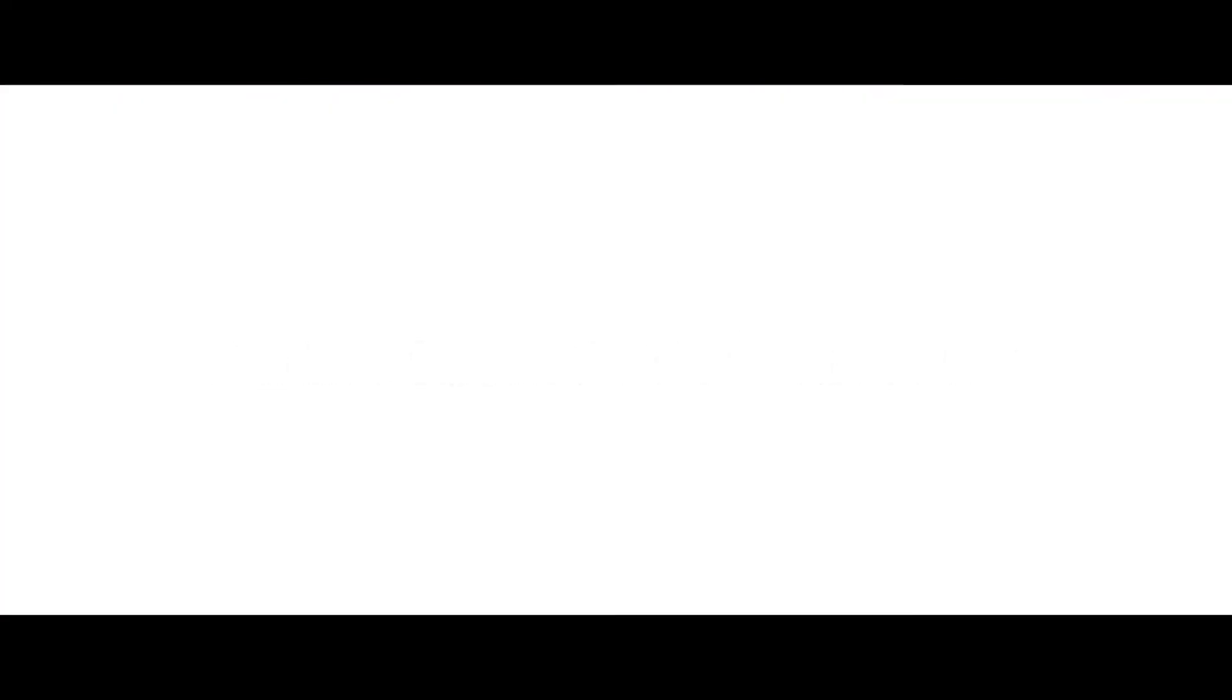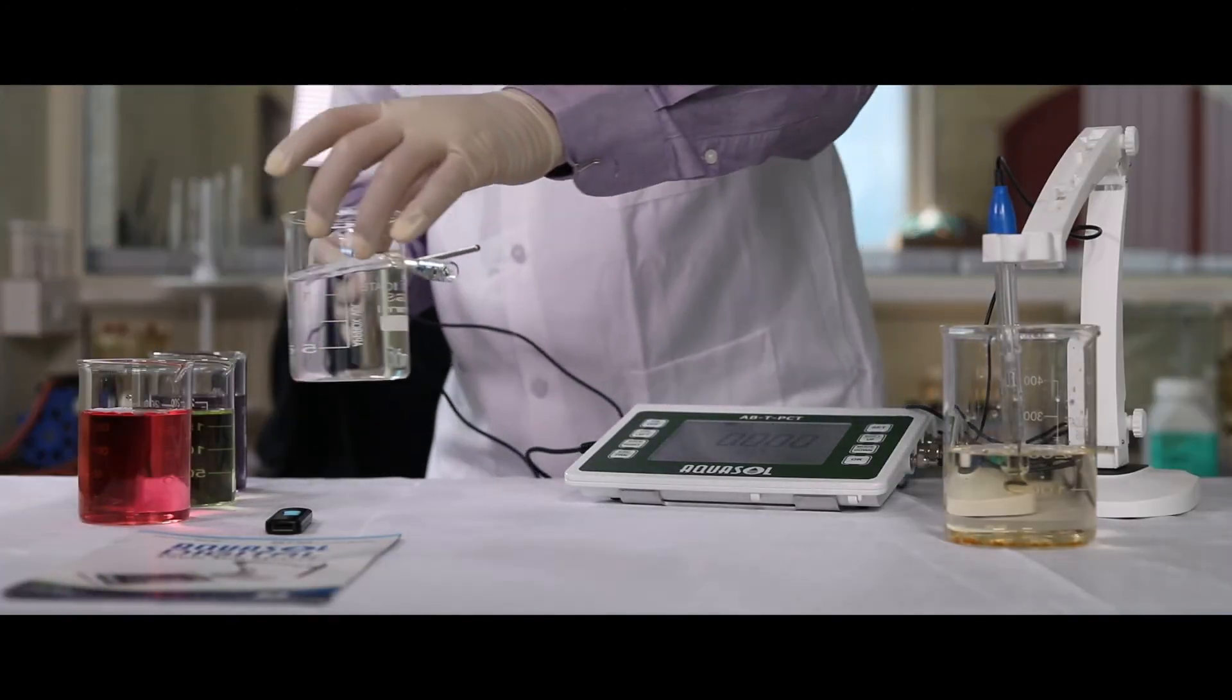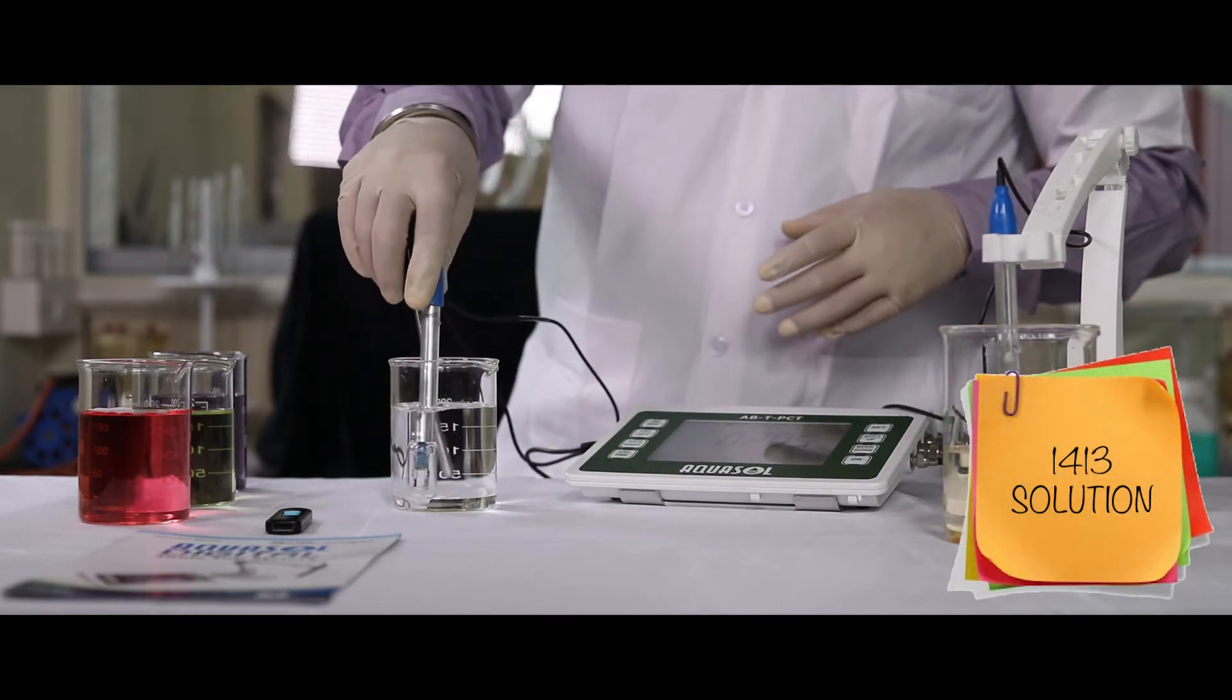Once the pH is calibrated, let's calibrate conductivity. Place the conductivity electrode in the standard 1413 solution.